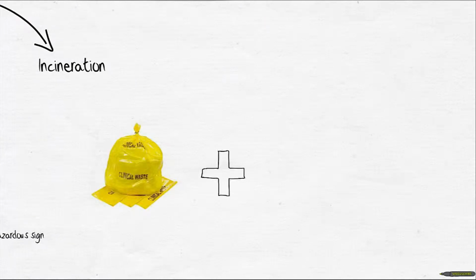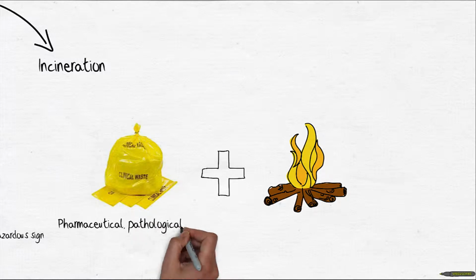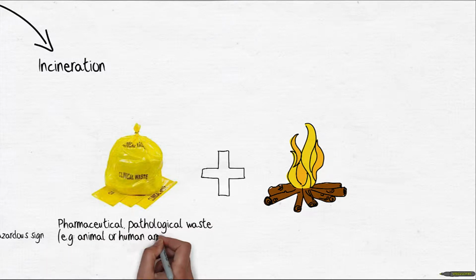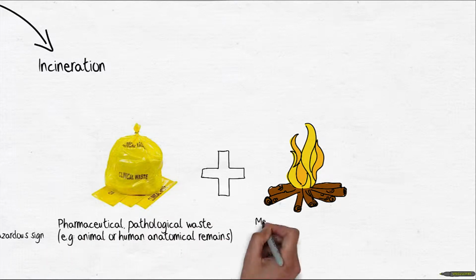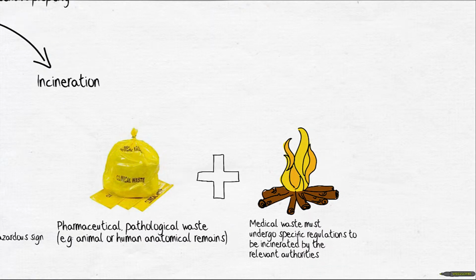Moving on, incineration is used to dispose of clinical or pathological waste, such as animal or human anatomical remains. Clinical waste must be contained in yellow incineration bags, which will be assessed by the relevant authorities under certain guidelines and regulations.